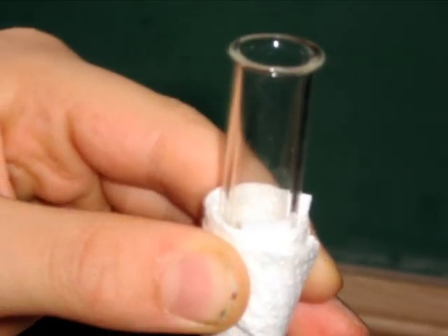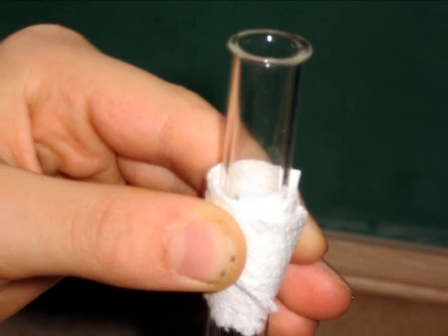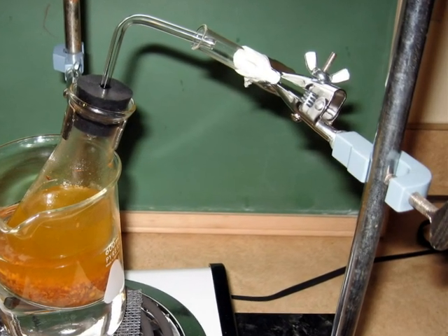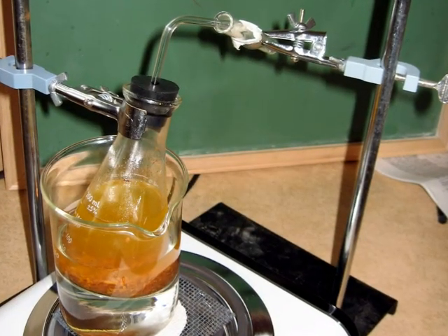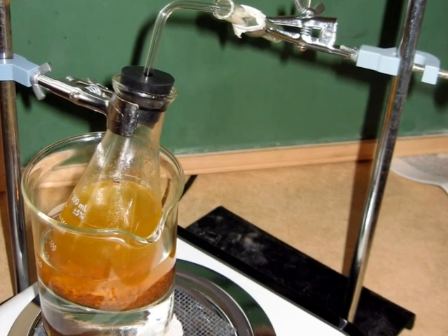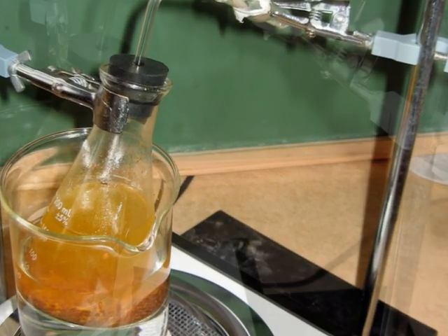You may want to wrap some paper towel around the test tube that you will use to collect the essential oil. Using the clamps, position the test tube so that it is directly under the open end of the bent glass tube. At this point, your distillation apparatus should be completely assembled and you can turn on the heat to start the water bath boiling.